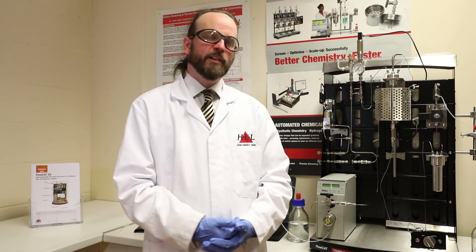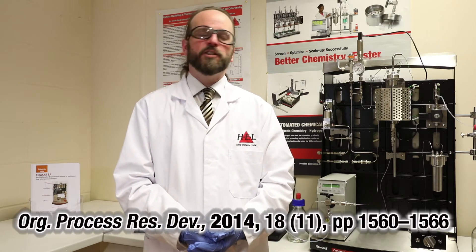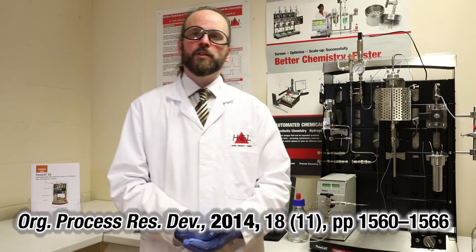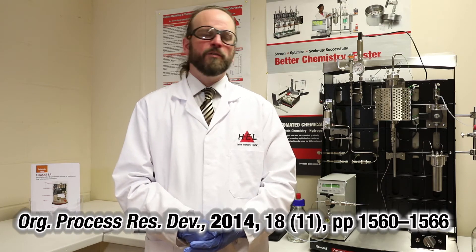This system is designed to produce around a kilo a day of material, based upon a hydrogenation reaction. There's an excellent example of this, which is shown in the OPRD paper, captioned below, which was written by the University of Cambridge, where they did a reduction of a nicotinamide and over the course of two weeks of experiments, scaled from what was just a concept in the paper they had read, up to two kilograms a day production.